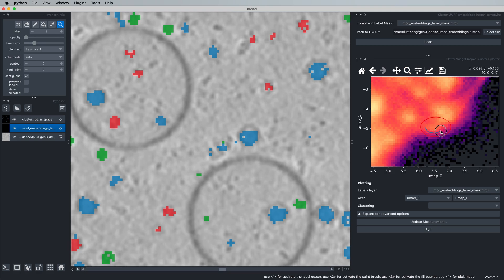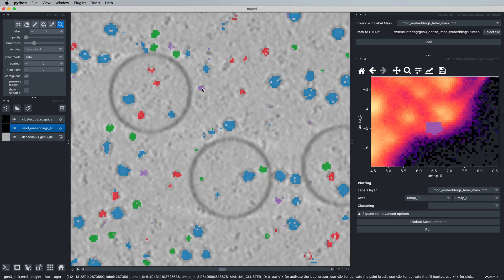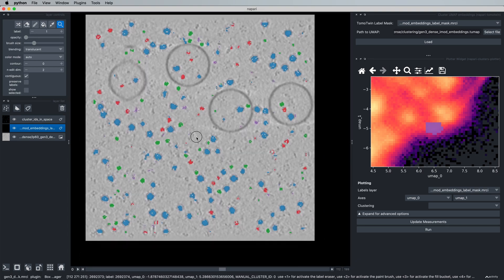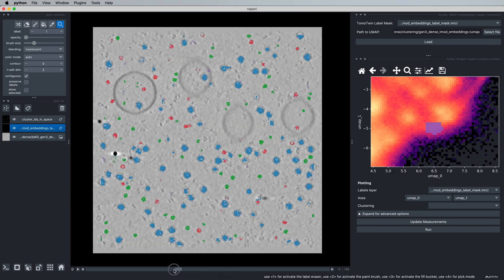We can now draw a cluster of interest around these embeddings. And we can see that our protein of interest is picked as well as additional similar particles in the tomogram.